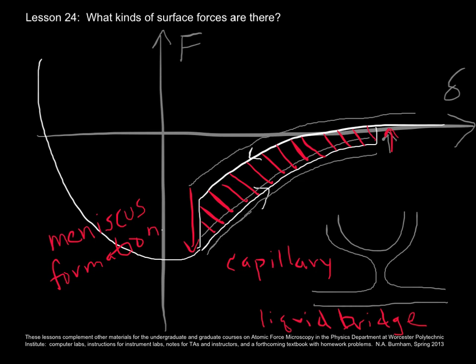So the energy in that area corresponds to the amount of energy it takes to pull the capillary out and then have it break.